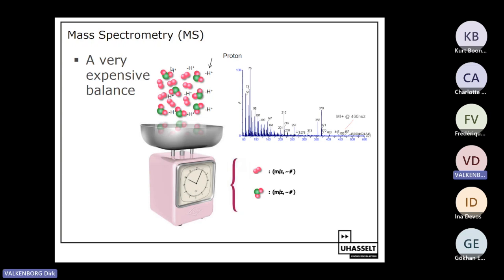And it's also possible to have molecules that are negatively charged, so they have an additional electron. So we need this charge to manipulate the ion beams inside the mass spectrometer and do some ion optics, as we call it, inside our instrument to steer these beams of ions throughout the mass spectrometer and have the ability to manipulate and measure the weight of these molecular ions.